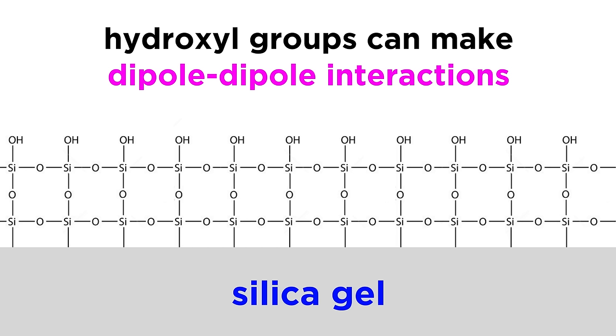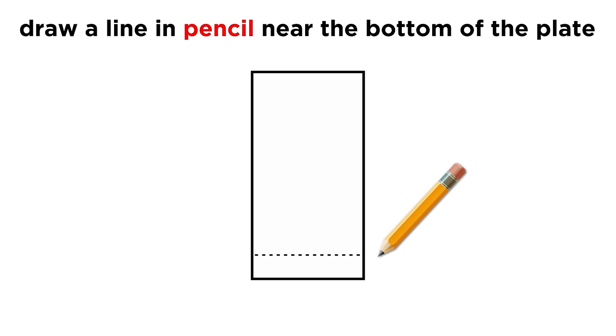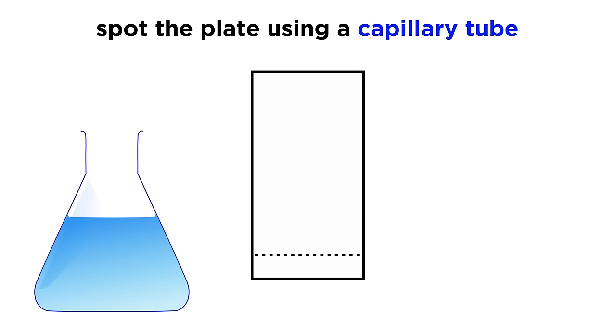These of course are polar, and can participate in dipole-dipole interactions with other polar substances. Now in order to perform the separation, we will draw a line in pencil fairly near the bottom of this plate, right on the silica. Then we take the solution containing the components to be separated, and insert a capillary tube. Some of the solution will rise up into the tube by capillary action.